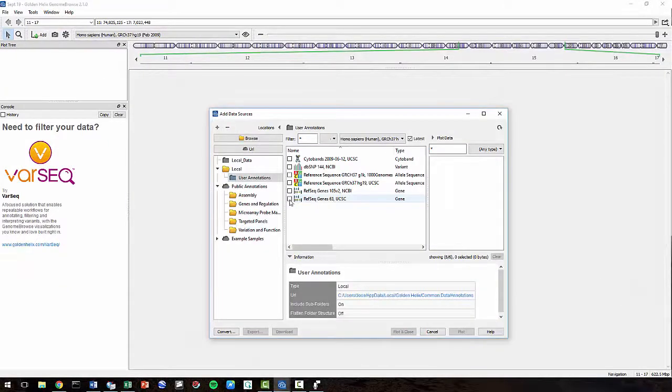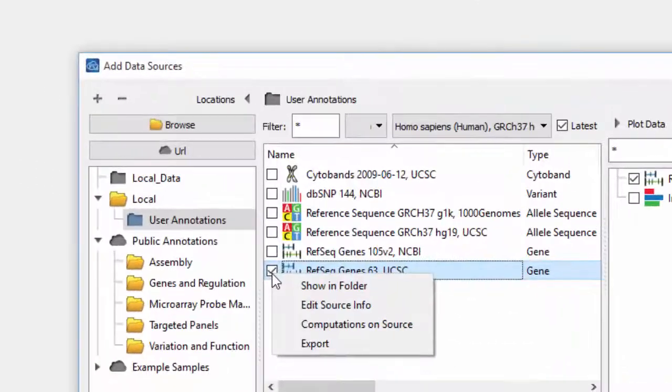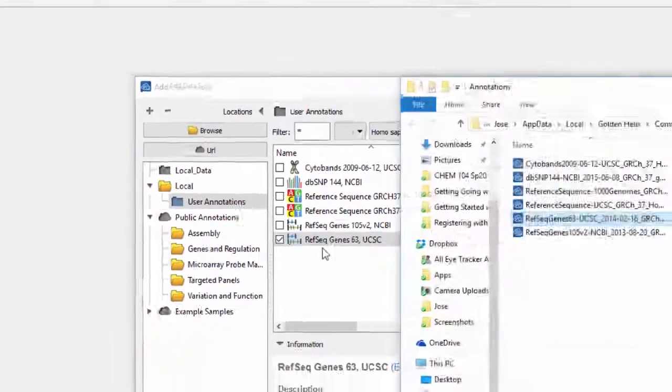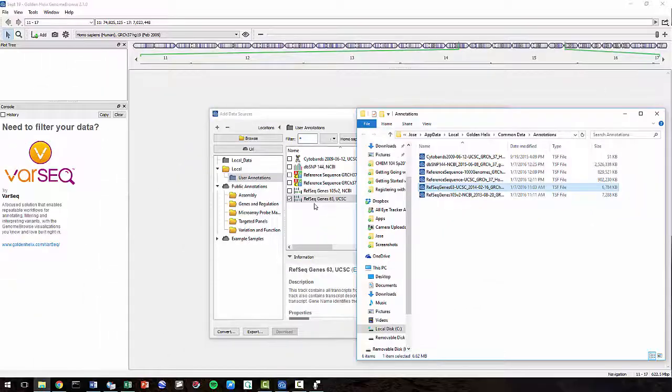Once the downloads are complete, go to User Annotations, right-click on one of these files, and select Show in Folder. Let's minimize this for now, we'll use it again in a minute.